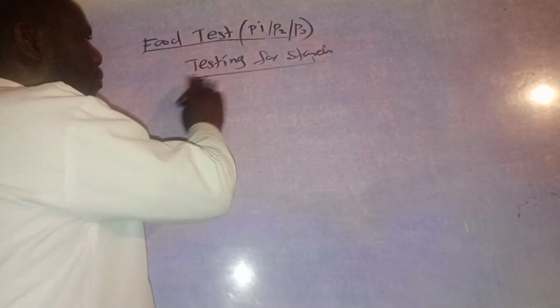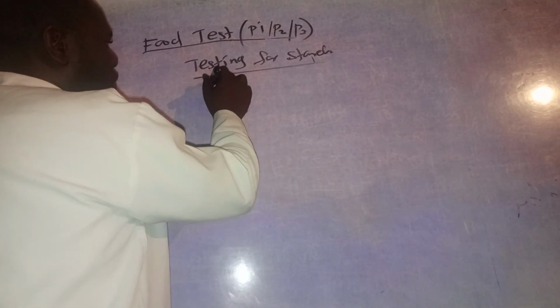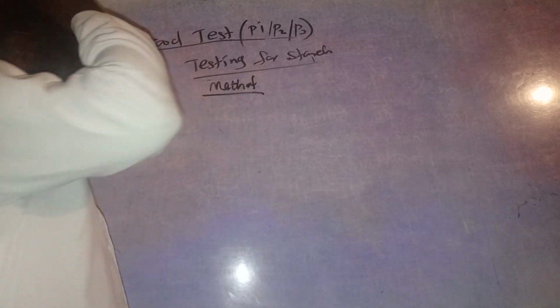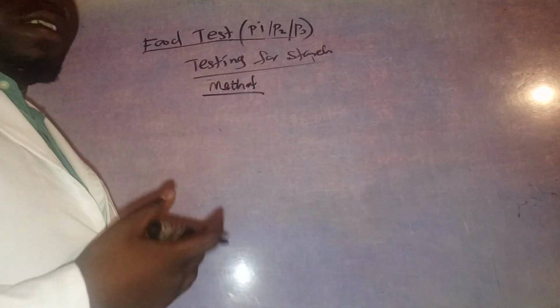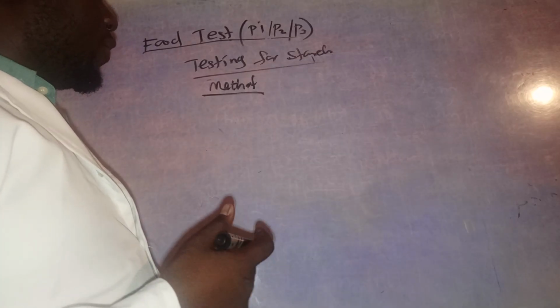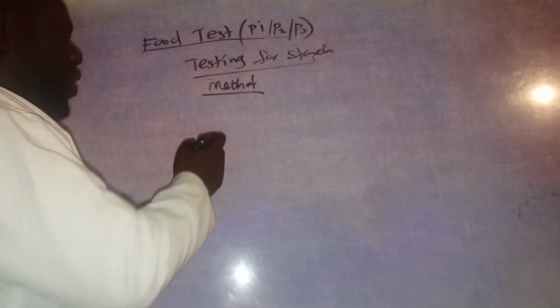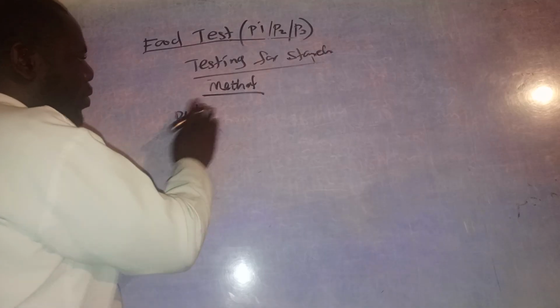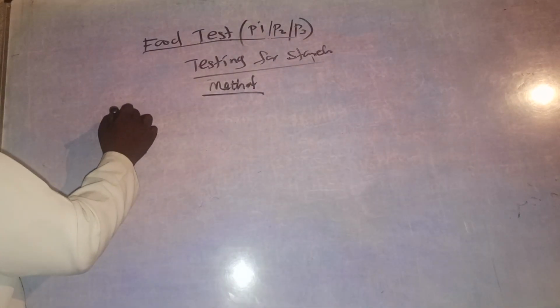So I'll start with the method. This is the procedure for how you're supposed to carry out the test for starch.